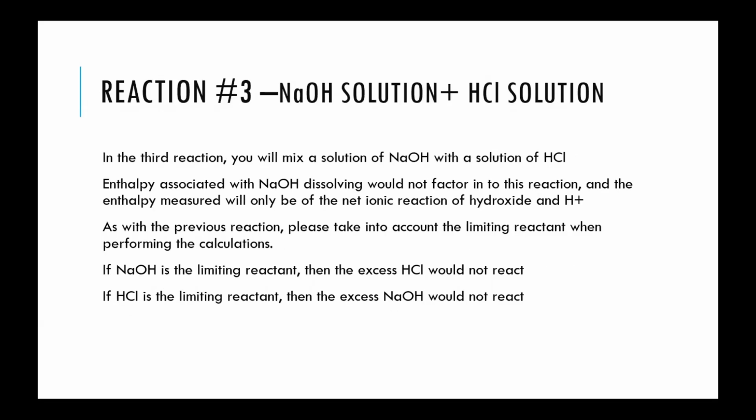The third reaction takes a sodium hydroxide solution and reacts it with a hydrochloric acid solution. In this case, the sodium hydroxide has already dissolved. That heat or that enthalpy associated with dissolving sodium hydroxide is already taken into account.